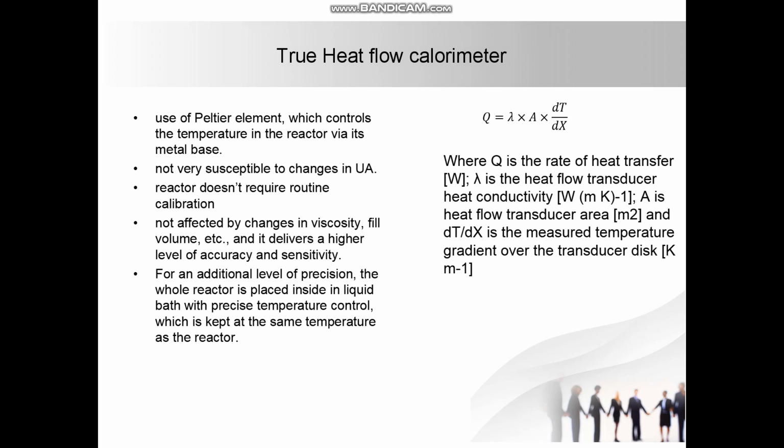Next is the true heat flow calorimeter. This calorimeter actually uses a heating element known as a Peltier element of fixed area. Thus, it is not susceptible to changes in the UA because the area is fixed and heat transfer is from solid directly to the liquid. Thus, there is no major role of U, and it is not affected by changes in viscosity, fill volume, etc.